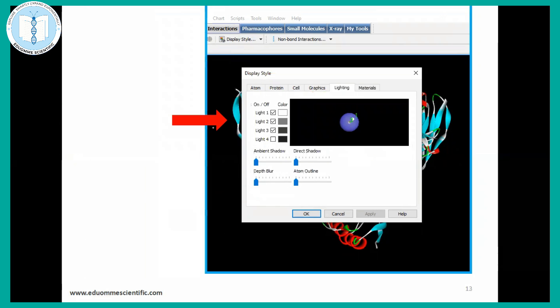For our publication point of view, the lighting and DPIs are very important. You can play with your lighting settings also to get the best structure visualization.